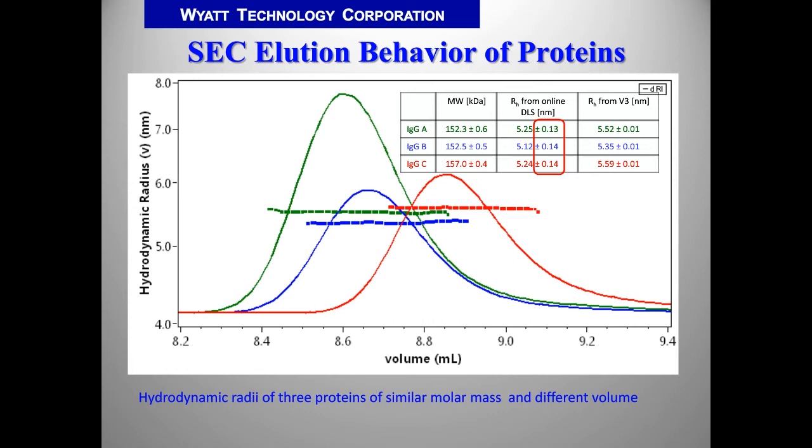So basically, we would have to consider all results to be identical. If you look at the uncertainty from online viscometry, it is extremely low. That means we can now differentiate the difference in radii of the 3 samples. And now I give over to Steve back for conclusions.